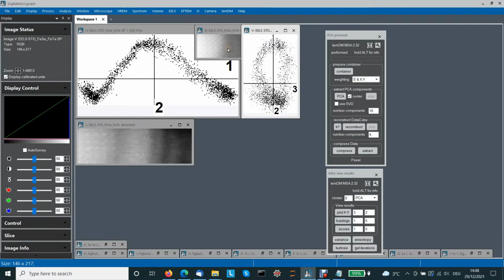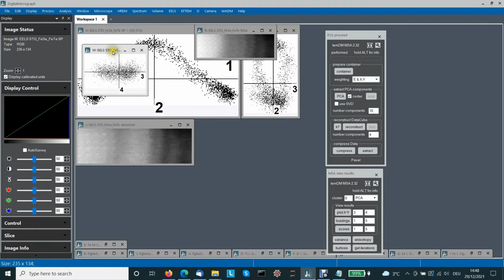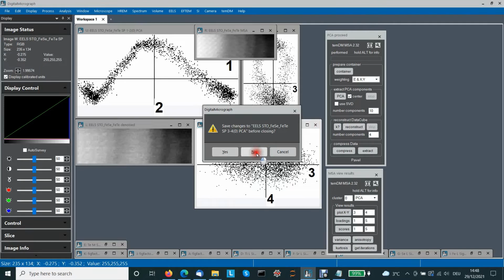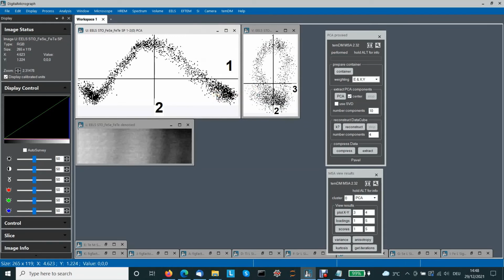In fact, there is also a 4th dimension. We can try also to investigate the scatter plot between components 3 and 4. But that would not be very informative because all data variations along the 4th axis are not so pronounced. So probably let's stay with three principal component axes, and already there we have quite a clear idea of how our data distribution is.